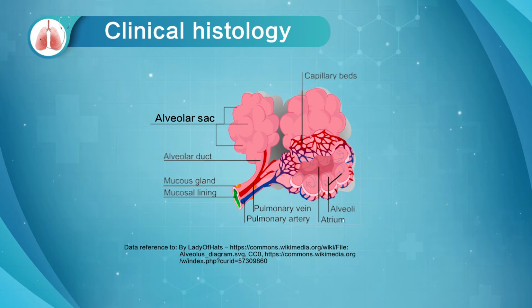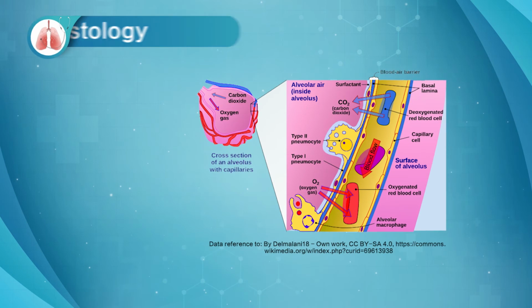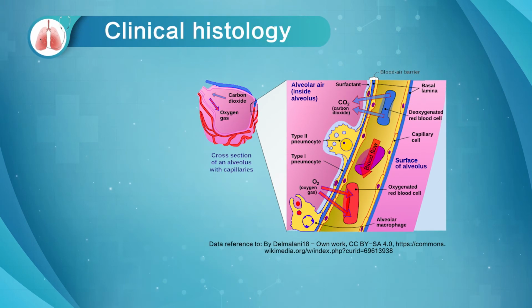Then, let's take a closer look at these alveolar epithelia, which are simple squamous or cuboidal epithelial. These alveolar cells can be divided into type 1 and type 2. The alveolar epithelium is connected to the underlying loose connective tissues. They have many capillaries, a small amount of smooth muscles, collagen, and elastic fibers, as well as immune cells. Shown in the picture is the alveolus.